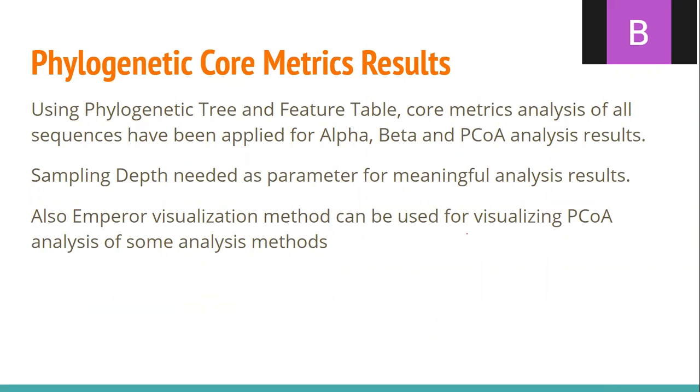After generation of the phylogenetic tree, we want the feature table. Our goal is to make the core metrics results, because we want to do analysis with them.